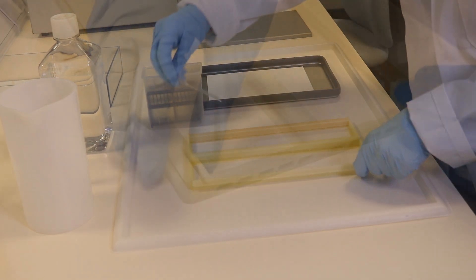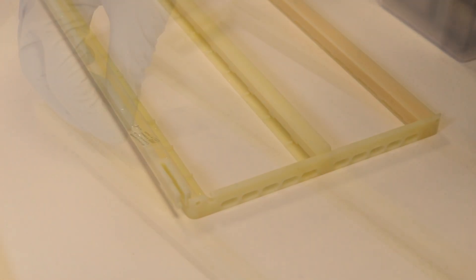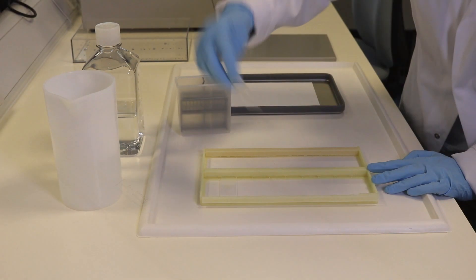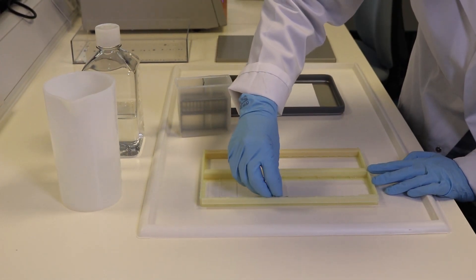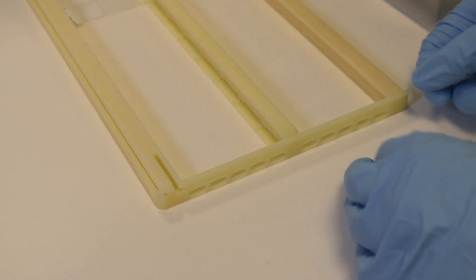Open the EasyBatch slide holder by squeezing and rotating the clamps. Insert the slides with the non-label side towards the centre of the tray. Close the slide holder by rotating and squeezing the clamps.